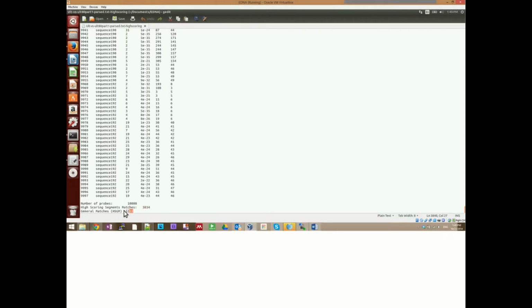These are considering other hits that are not high-quality matches. So in this case, out of these ones, we get only 3,834 high-quality matches. So this will tell us if it's positive or it's negative. Similarly to Megan, in Megan it will tell you the number of reads, but it's not telling you the depth of that alignment or anything, or doesn't have any quality check. So after all the quality checks, we have around 3,000 high-quality matches.